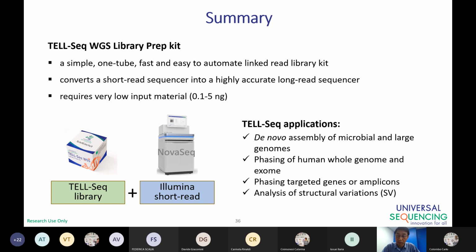Yeah, so for cDNA, in principle we can sequence. The challenge is that our software so far is only capable of differentiating two haplotypes. So for cDNA, it all depends on whether you are actually interested in looking at different isoforms. If it's more than two, at this moment we don't have a good solution for how to phase them properly. Yeah, so that's the challenge.